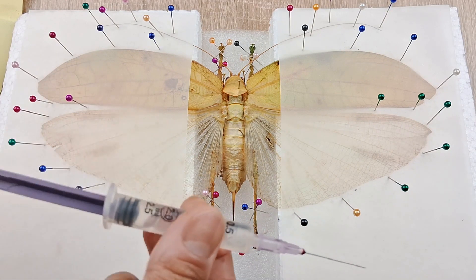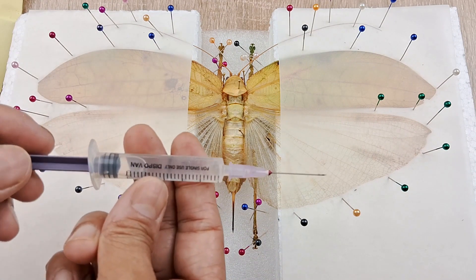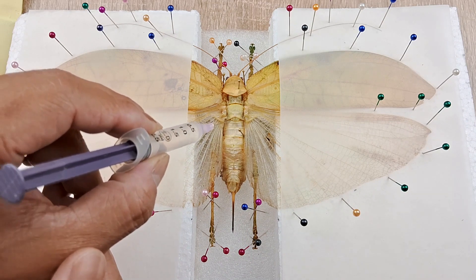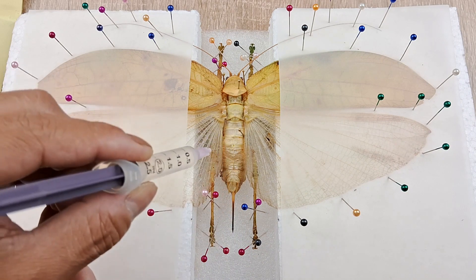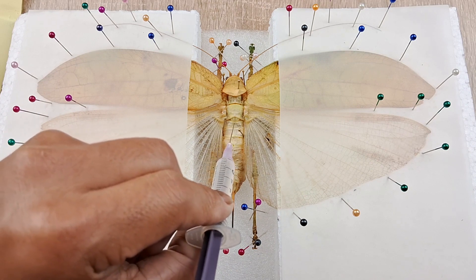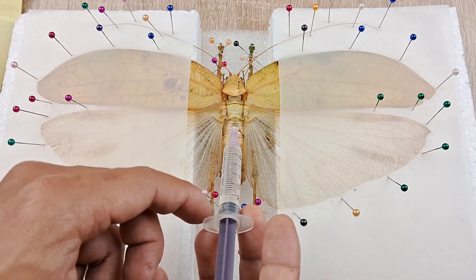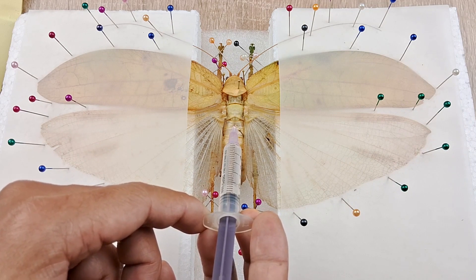Once that's done, we come now to the most important part of the preservation process. Fill the syringe with 80-90% ethanol or isopropanol and inject 1-2 ml each of the alcohol at several places within the abdomen. Start from the point where the thorax meets the abdomen and inject a good quantity of the alcohol into the thoracic interior. Do the same with the middle and then the posterior parts of the abdomen until the abdomen becomes visibly distended and excess alcohol starts leaking from the injection points.